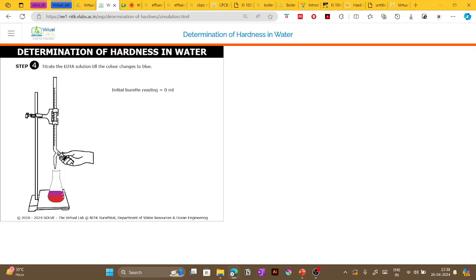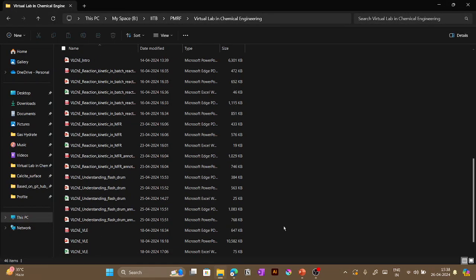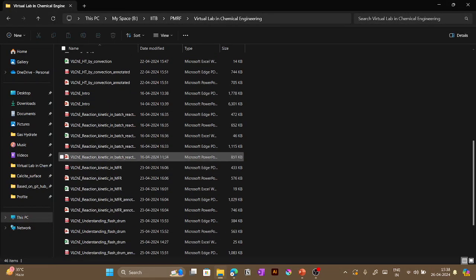And note down the readings. So you can see the end point will be detected by blue color. Okay, 10 ml reading answer આવ્યો છે. તો prepare an Excel sheet or just do a manual calculation in your notebooks.